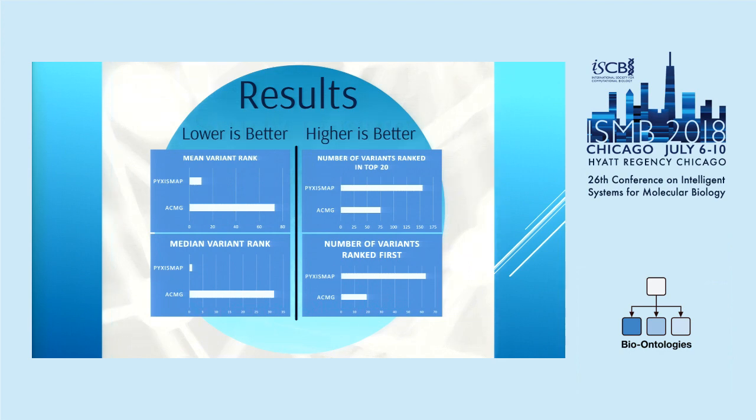On the left-hand side, you can see that the lower values for PyxisMap, which is on the top in both graphs, is lower, which is what we want, which we want a mean and median rank to be far lower, which makes our analyses faster. As well as on the right, you can see a higher number is better because we have the number of variants seen in the top 20 first variants for them to look at is 155, and then the number that ranked first was above 60, meaning that the variants that the clinician needs to see are going to be the ones that come up first, or far sooner in their analyses than otherwise would be.